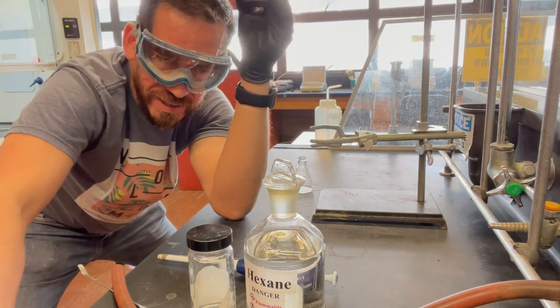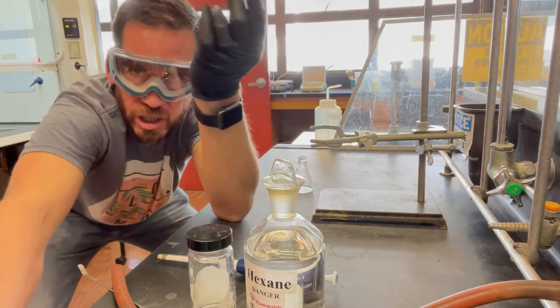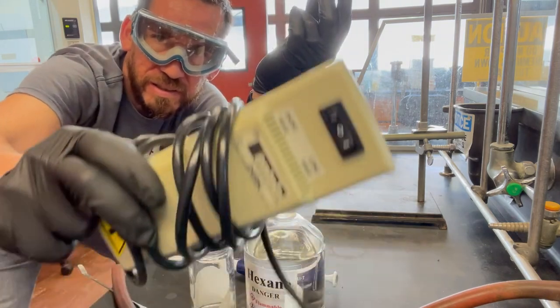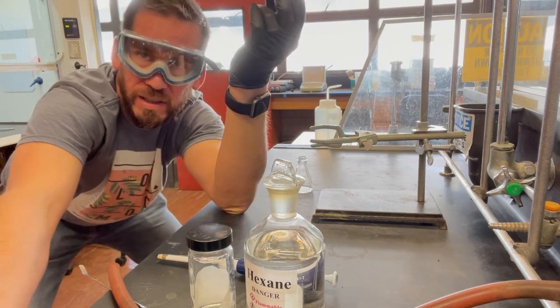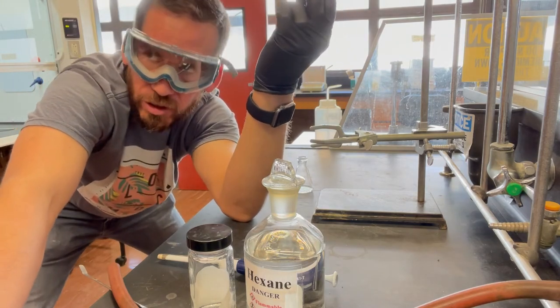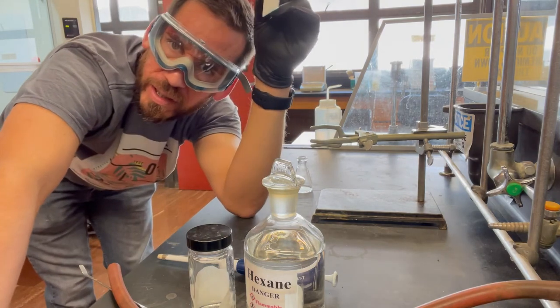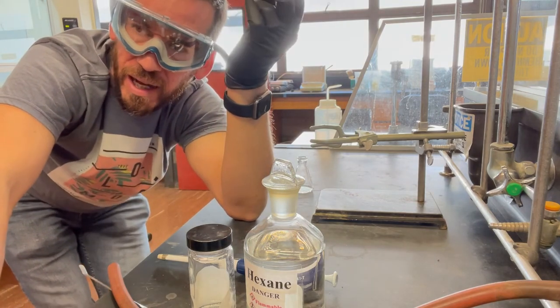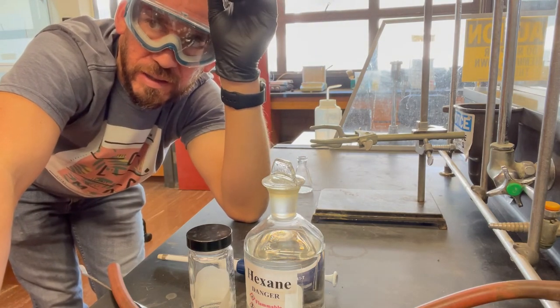But what we want to see in that TLC is, we'll see triphenylphosphine oxide, because that's got triphenyl, so that means it's got three benzene rings, so it's definitely UV active, and we're going to be using this to see those spots. And so we'll see the triphenylphosphine oxide, as well as hopefully the cis-trans isomers for our product. So the cis-trans and the trans-trans product. And then I don't know if we're gonna see that, because this filtrate was kind of sitting in the drawer overnight. It does react to light, so it is at least dark. And yeah, we'll see what happens.